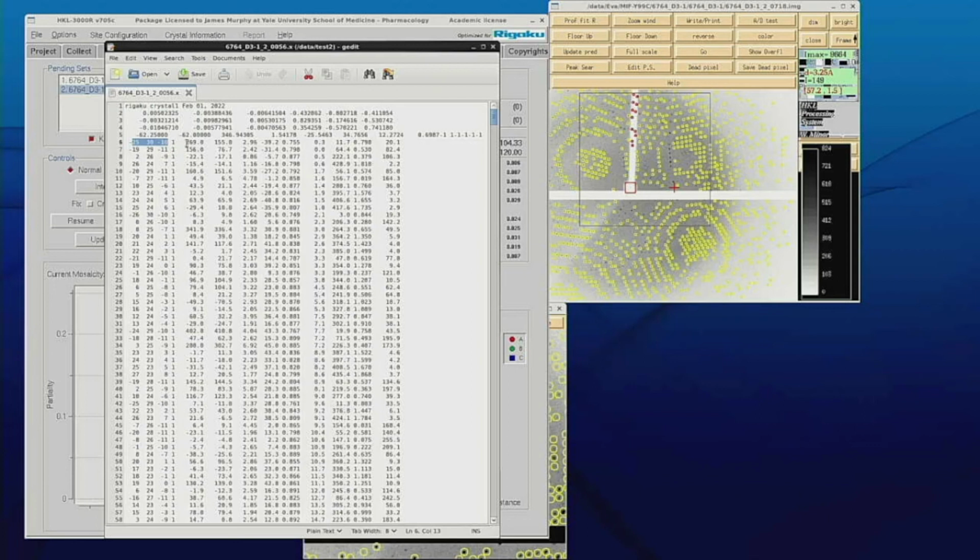And then it has information for the measured intensity, as well as some background information and also some geometric information as to where this spot is on the frame. But the thing to remember is that the integration measures each diffraction image, records the HKL and what the intensity for that HKL is on that frame.